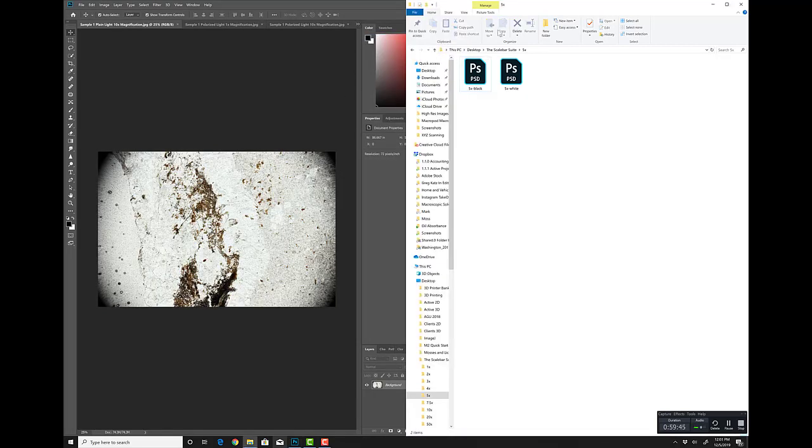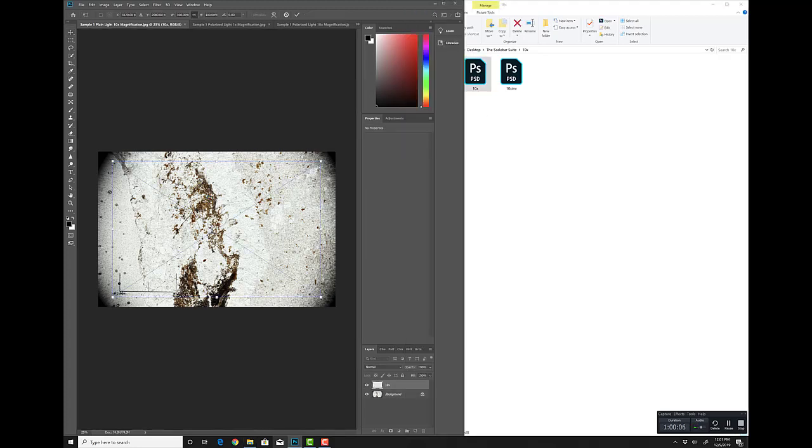This is where we're going to have some onset of vignetting. Now this is actually kind of extreme vignetting for what should have happened. I think that's because the thin sections here are quite thick, almost 3 times as thick as the standard thin section. These samples came from China, and I don't know if that's standard there or not. But this is a bit more extreme than what you can expect. It could also be just because the slide was elevated a bit.